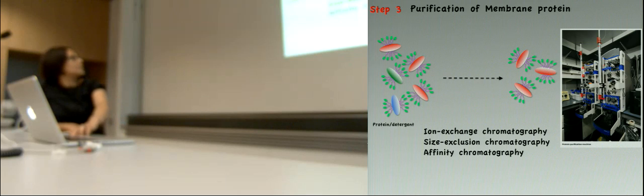For example, if you purify your protein and make a grid, you will see some proteins, and at the same time if you see big clumps or aggregates, that means your protein is starting to aggregate. So maybe this sample is not good, and you may need to include further purification steps, either size exclusion chromatography or something else to remove these big particles. So this is quite important too.